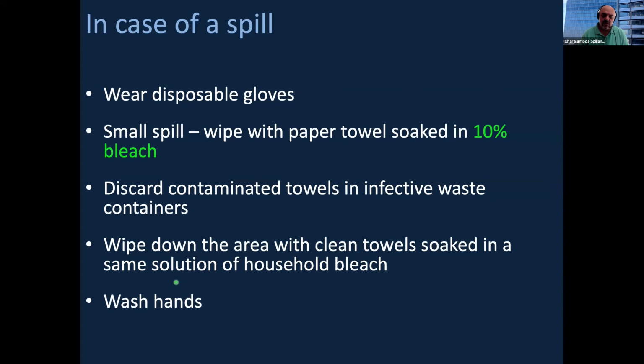So 80% alcohol, 0.125% hydrogen peroxide. This is the recipe for disinfecting SARS-CoV-2. If you want to use it on your hands, then 1.45% glycerol would make the difference. So that's all I wanted to discuss with you. I would be happy to take any questions you may have.